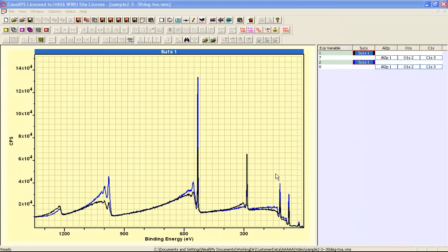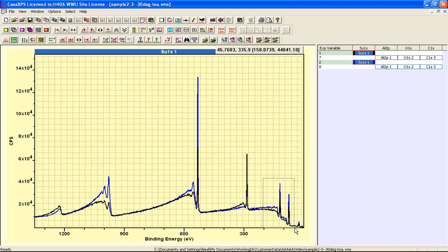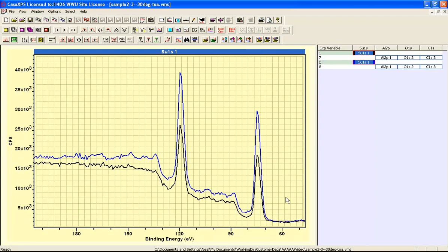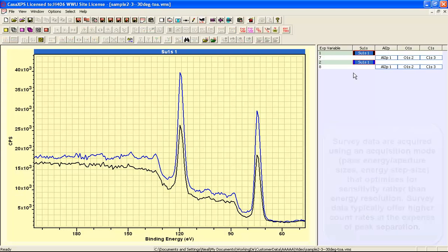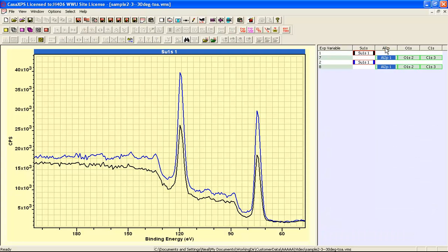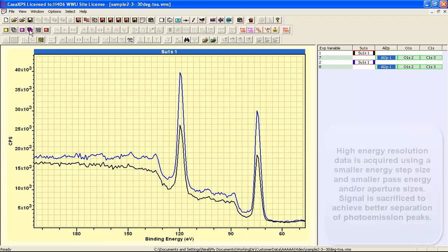The survey data include peaks that have a resolution that will allow us to see the difference between aluminium 2S and 2P, but any structure within these peaks is missing. So with high-resolution data, we would like to think that we can see the chemical state information that might be here within these aluminium peaks, and indeed we can.